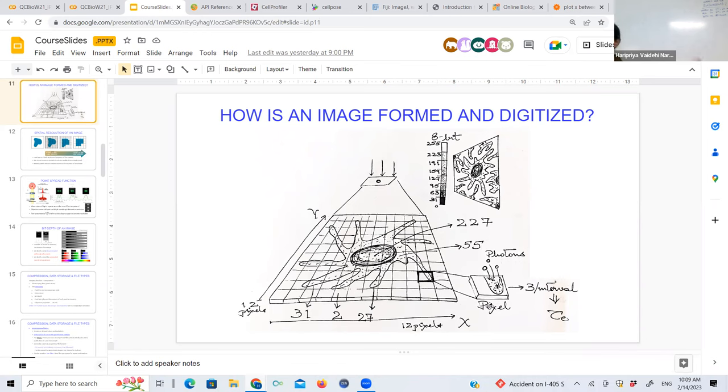I just cannot. So if I've measured something on a range of 0 to 300 photons, and I said, I want 600 colors on this, give me colors for every half photon, that makes no sense. You never want to set up your collection like that. And if somebody collects that and tells you, wow, look, I have this amazing resolution on my image, don't get fooled by it. It's just fiction, okay?